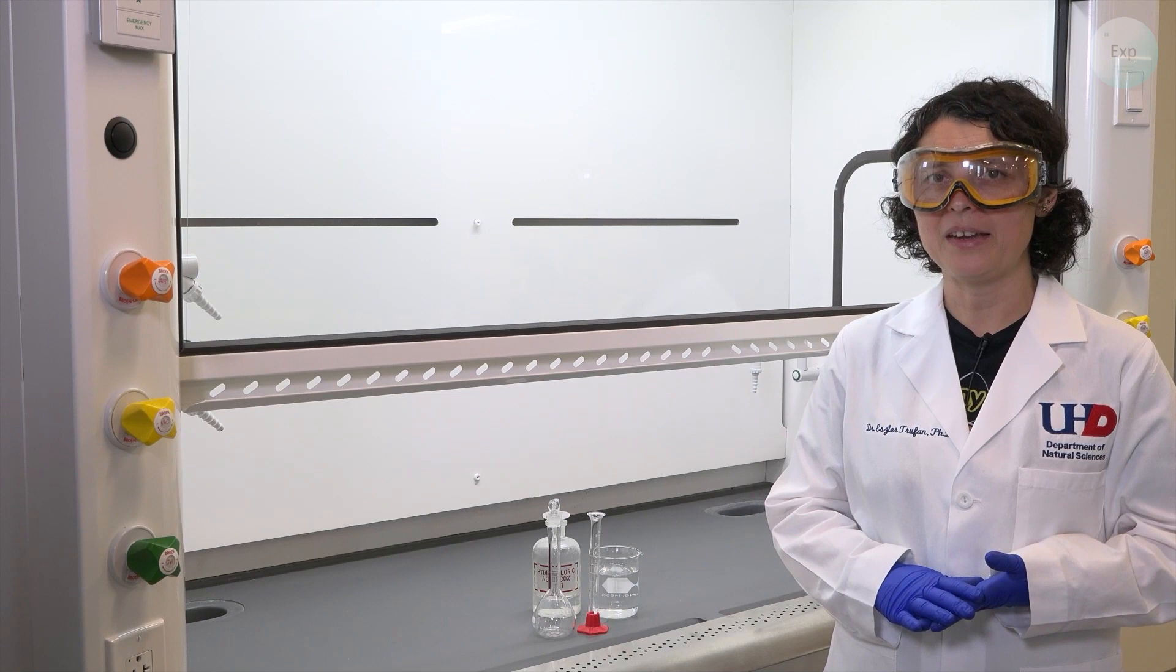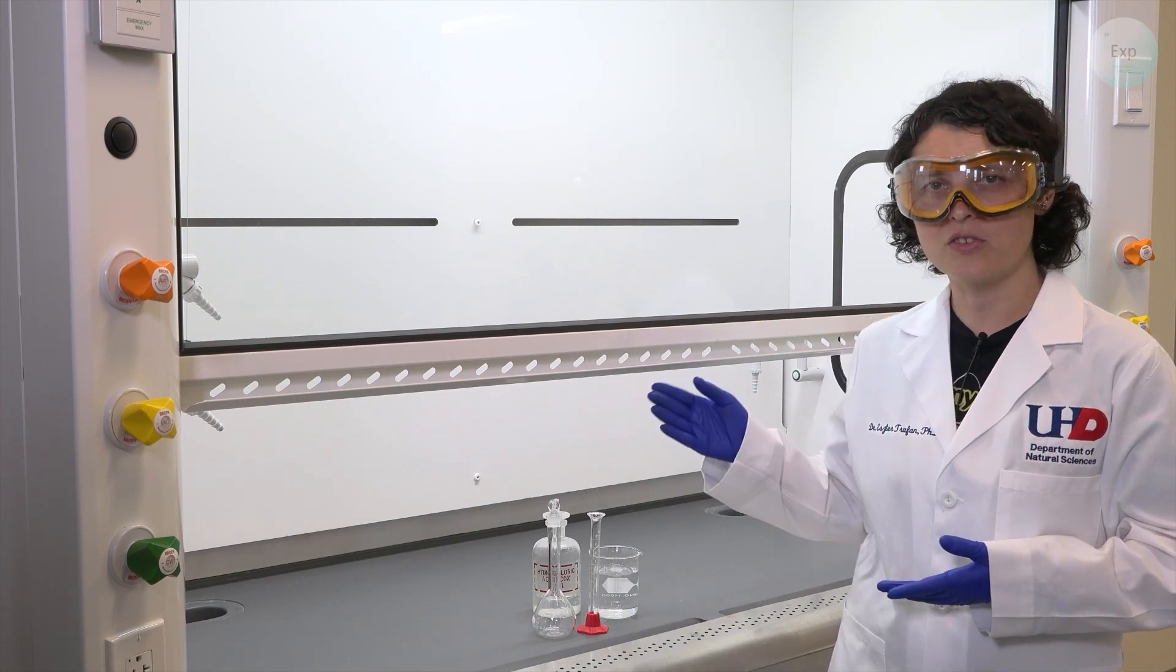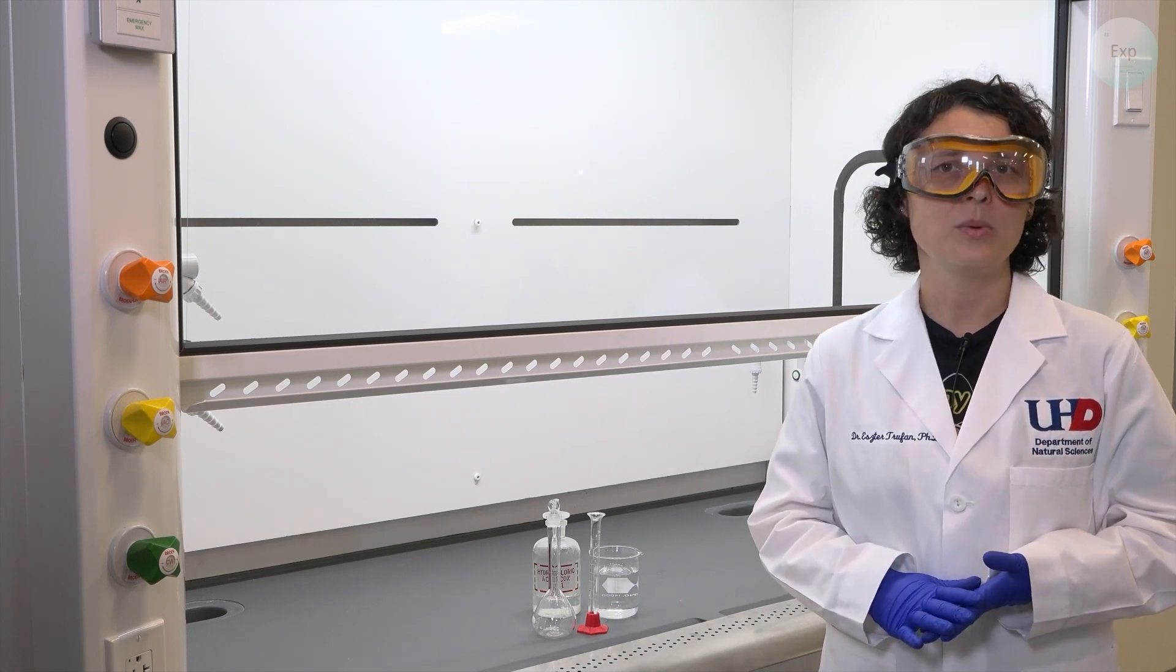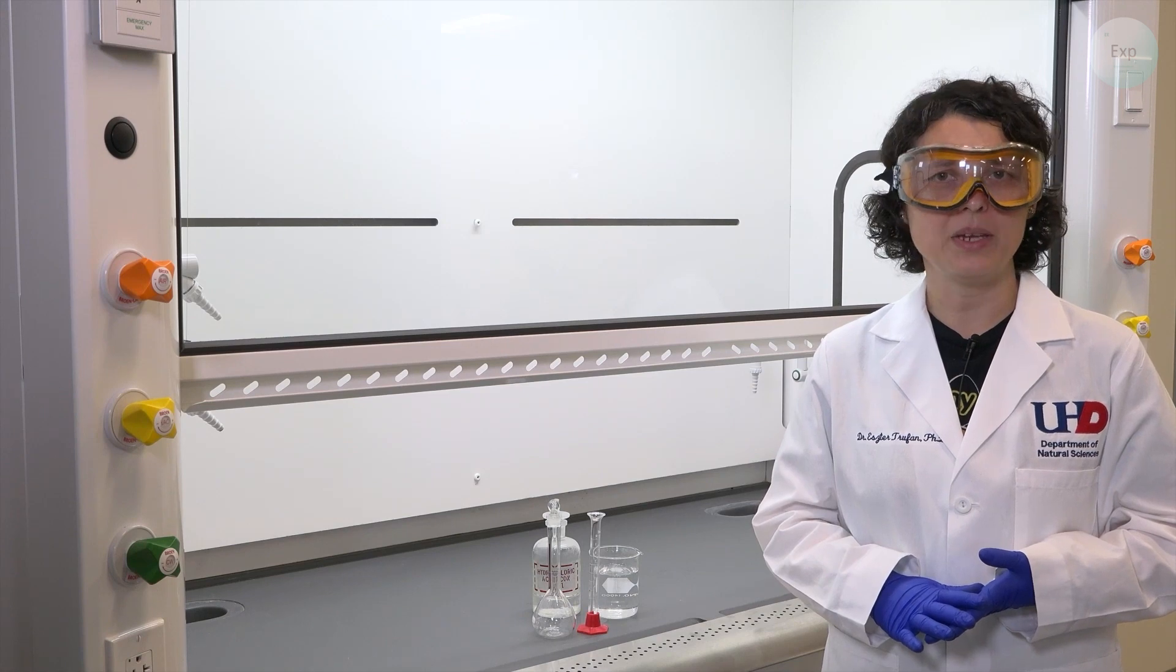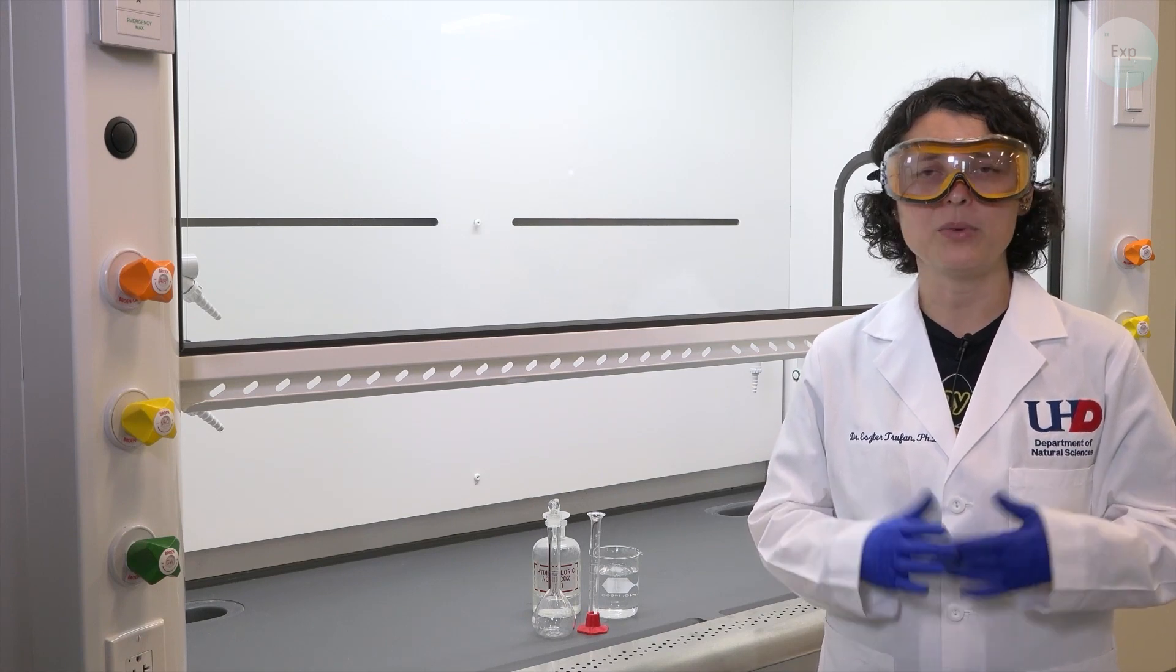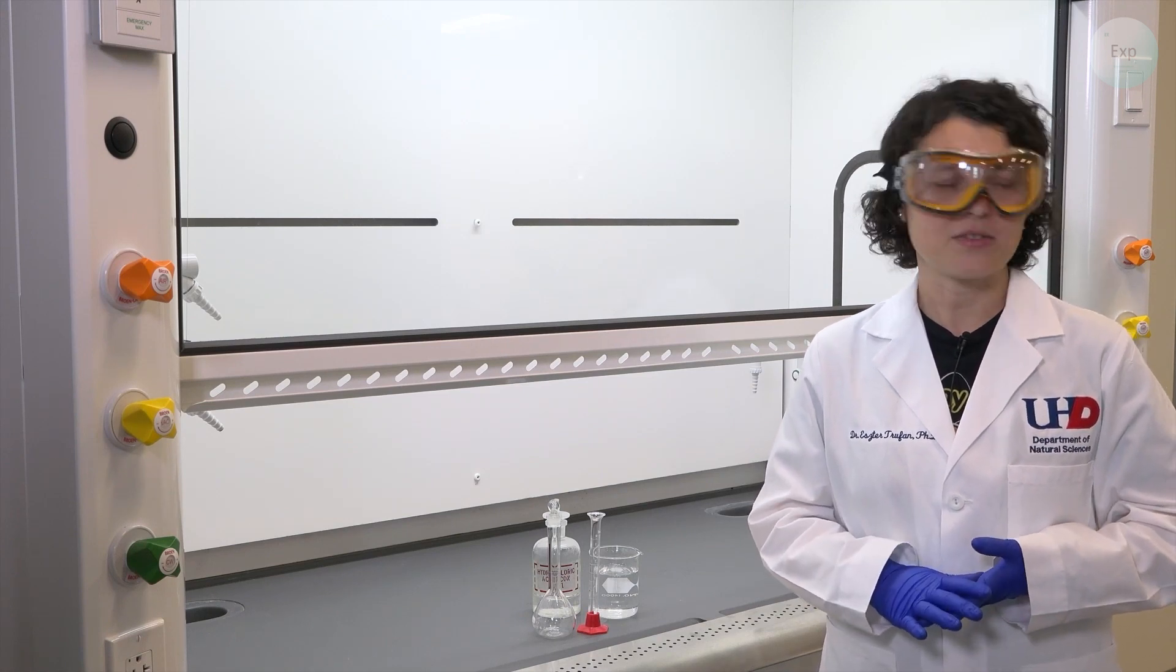And because we will be pipetting material out of our concentrated hydrochloric acid container, we will need to first transfer it into a beaker and then using a pipette with a bulb we will need to make the transfers.